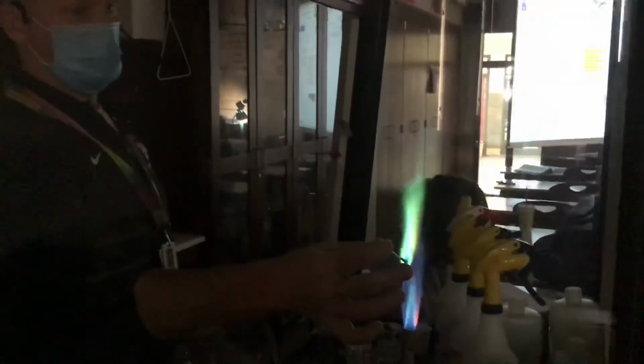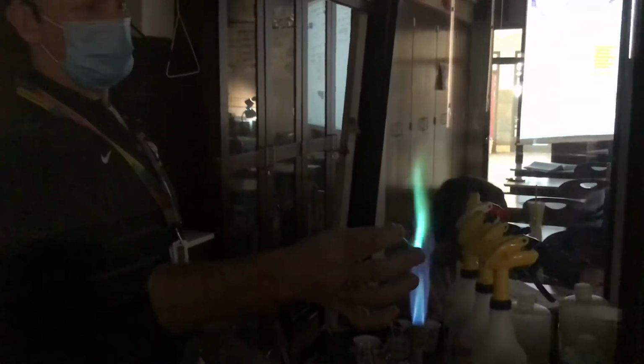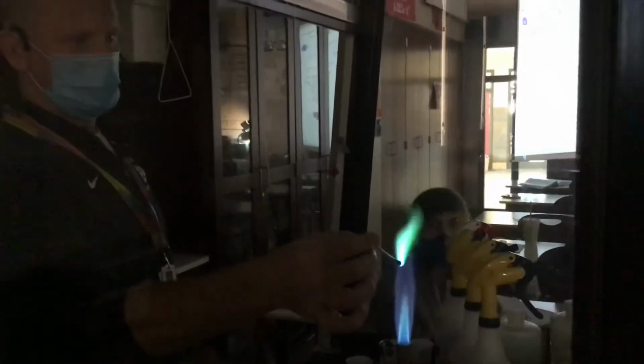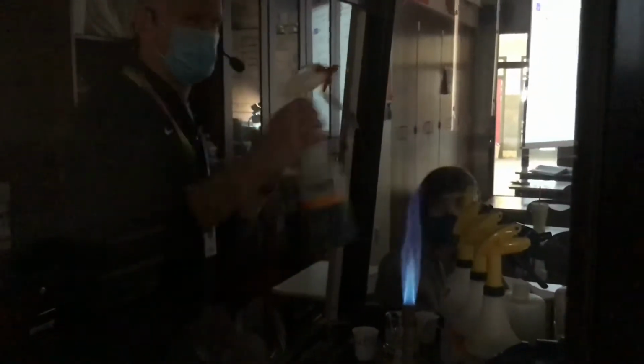When you see a firework that is this color, that's because it's got copper in it. What color is this one approximately? Green. Kind of a greenish bluish, yes? Fireworks, of course, don't have a Bunsen burner inside them. They have an explosion inside of them, but that's enough energy to excite the electrons, move them away from their nucleus, and then when they return to their space, they give off energy that we can see as, in this case, green light.